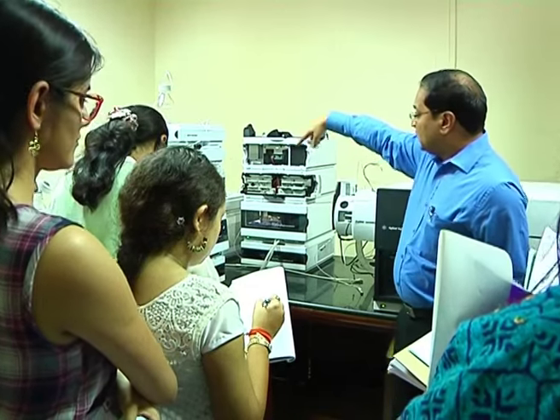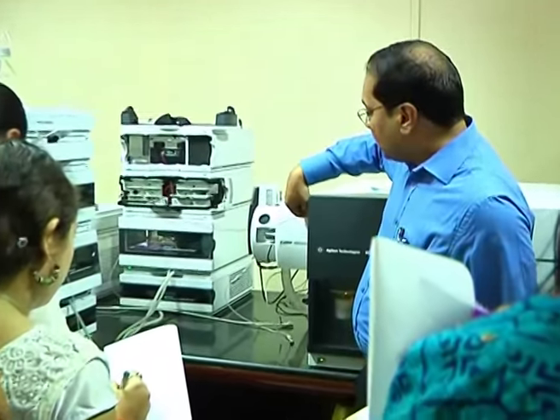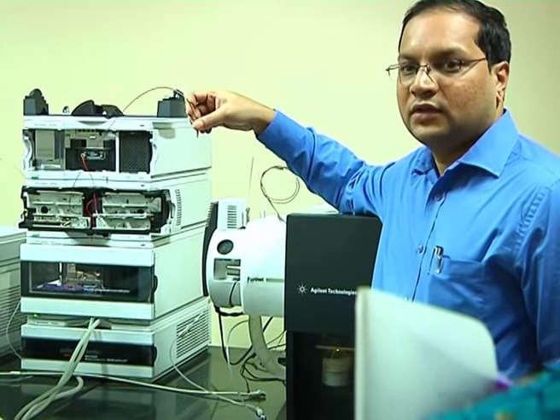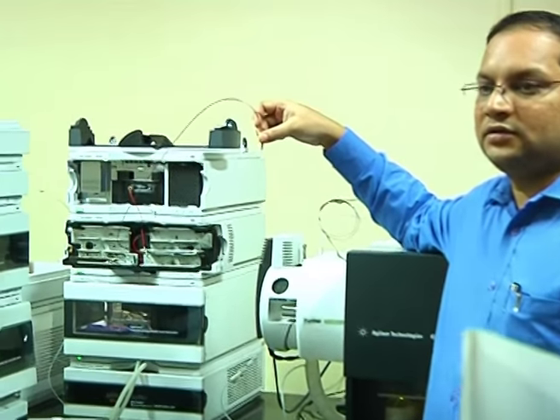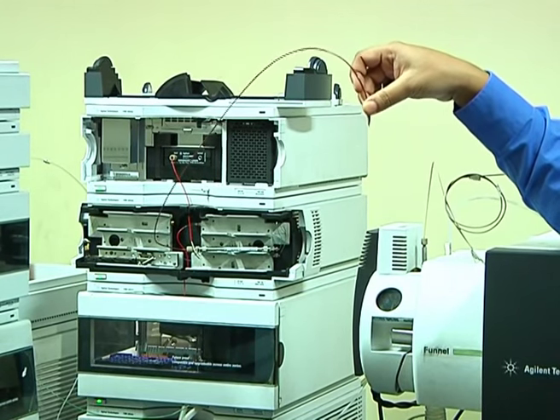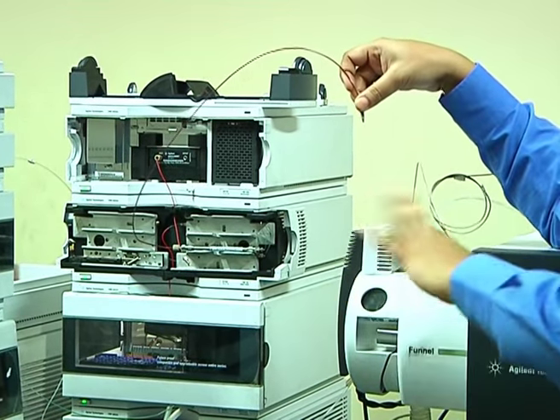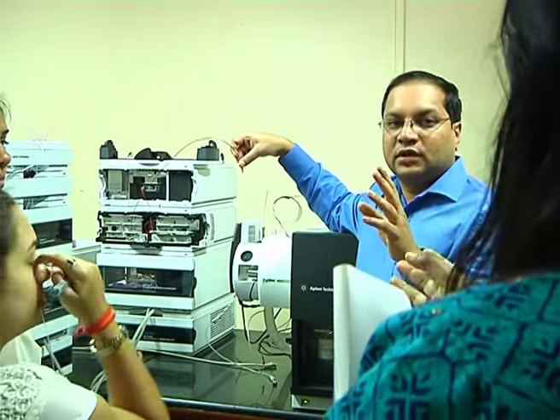Within that peak. So as I told you, it runs through the column and then it elutes in the form of liquid like this. Right now the method is running at 0.4 ml per minute. You can go to 1 ml per minute, but of course with this source only; I am not going into the details of the specification of this source.